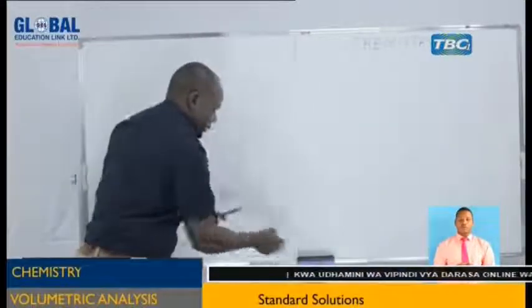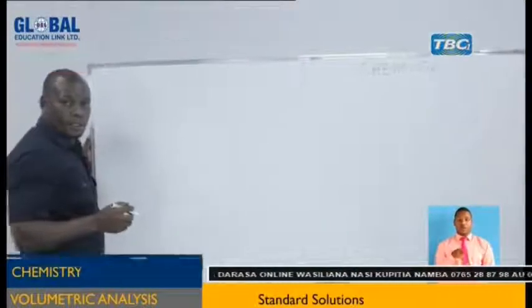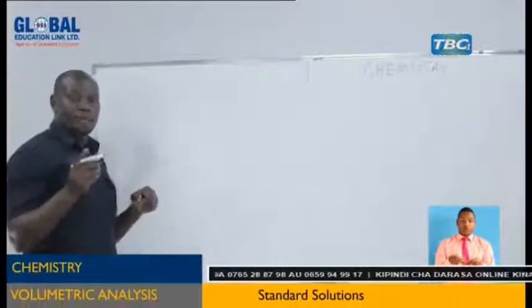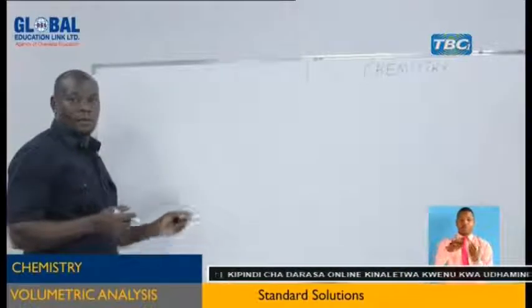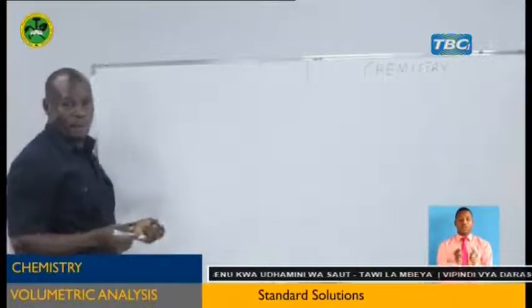Normally, for chemicals that appear in solution, which means they are bought from shops in terms of volume, how can you prepare those solutions according to the concentration that you have been asked to prepare?